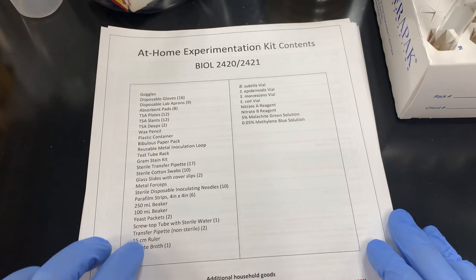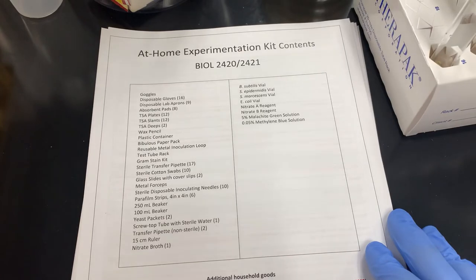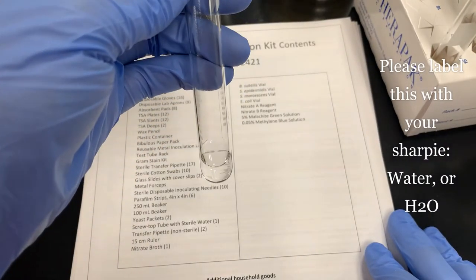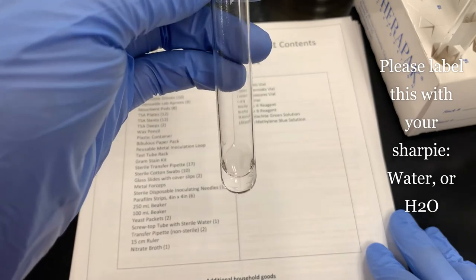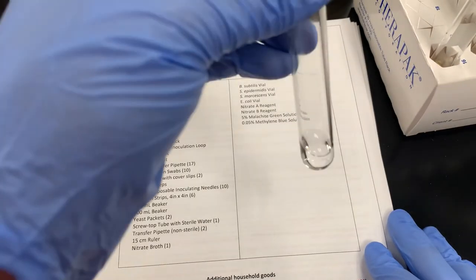You get two of those. Screw top tube with sterile transfer, sterile water. That's this. You get a screw top tube. It has a tiny bit of water down there. I believe you're gonna use this during the first lab. This is sterile. It's very tiny. It's very different than the agar that we've seen before.